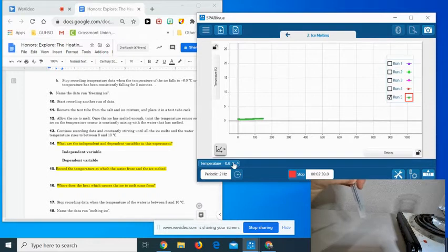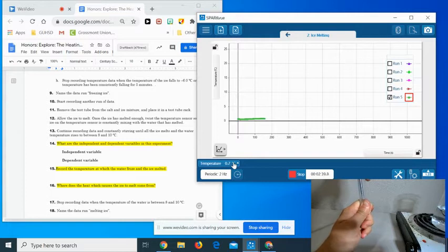And so for this, we're going to run it until it's between 8 and 10 degrees Celsius. So I'm going to take the warmth of my hand and put my hand around this, okay? What's that going to cause that ice to do? Think about that. We can just know from our experiences what that's going to do. And we're just going to sit there and let the ice melt.